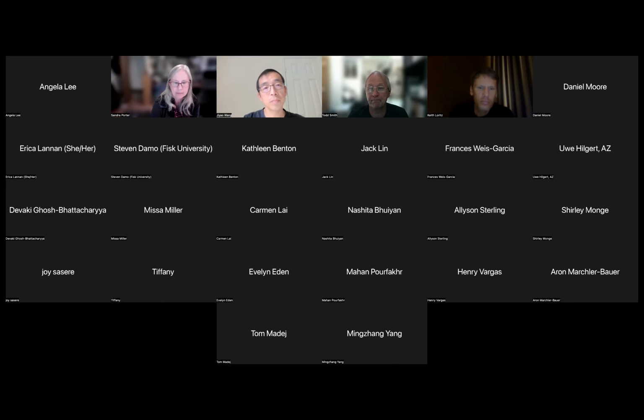I also want to add that you can embed iCn3D in your own web page. You can either just use the iframe version, or you can integrate it with your own system. There's even one person using it in an Open Libre textbook, Henry Chuck. I can't pronounce his last name.